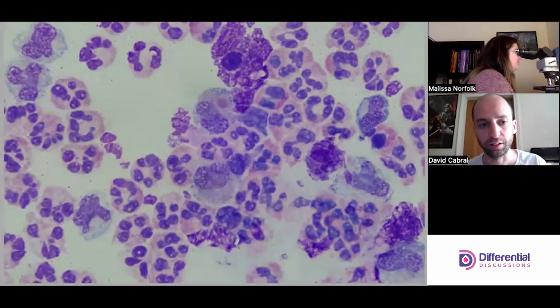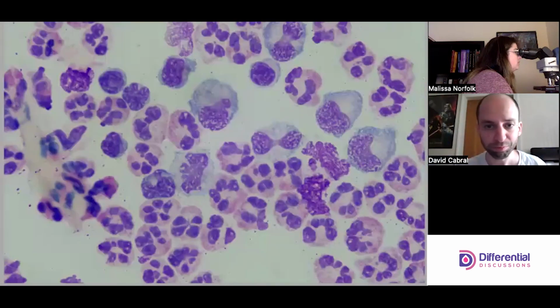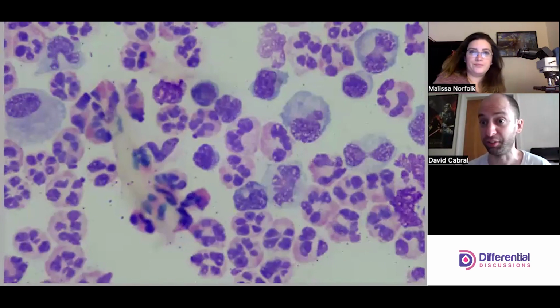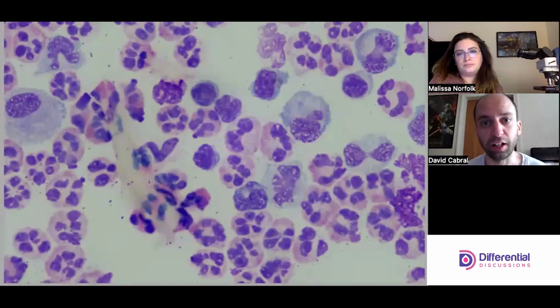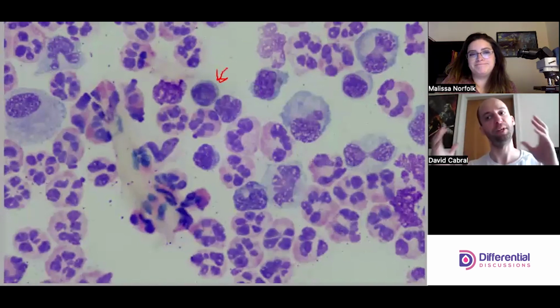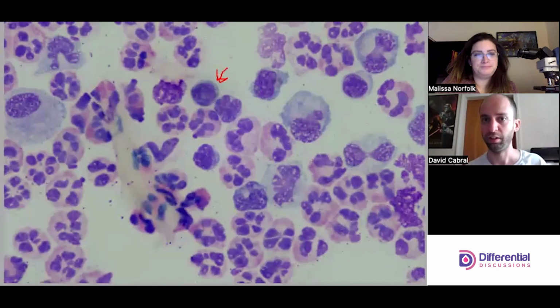All right, let's move around a little bit. My wonderful driver, Melissa. Okay, so we got some lymphocytes that have joined the party. I have one beautiful lymphocyte here. With lymphocytes, round nucleus, scant cytoplasm, we expect that to be consistent. Because it's a cytospin, the lymphs might appear a little bit larger than you might expect. That's okay. So the nuclear to cytoplasm ratio will be really important here.